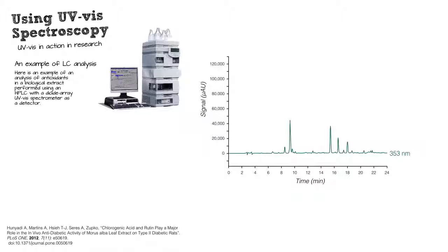So here we're looking at 353 nanometers for this particular extract, and if we put it through the column and all this data is being collected simultaneously, just ask the computer, hey, what did you observe at 326 nanometers? And you see the spectrum looks substantially different. So now I see the absorbance at 326 for this peak is higher than at this point here in time. At this point in time, whatever's coming off, the absorbance at 326 is a little lower.